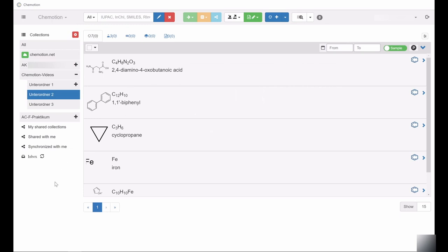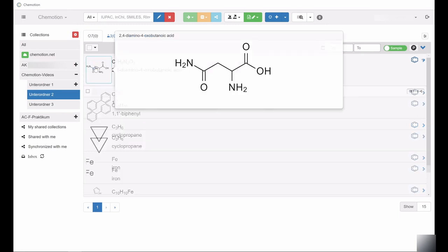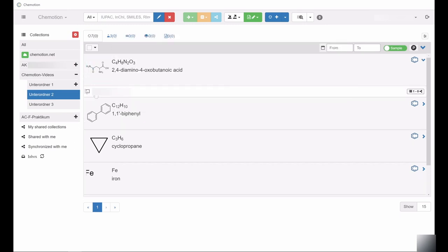If you indeed intend to permanently remove entries from the Chemotion ELN, including removal from the All collection, click the respective entry and select Remove from All collections.